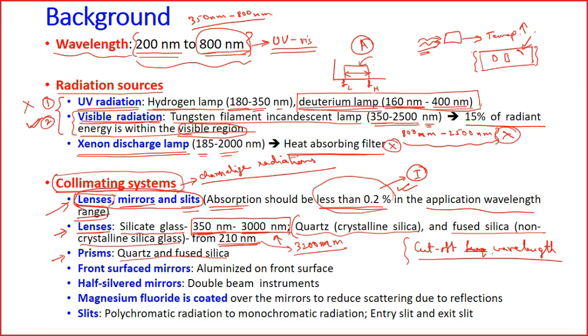To specify the wavelengths we are using, and reject the wavelengths we do not need. Not exactly. Anyone who would like to give it a try?